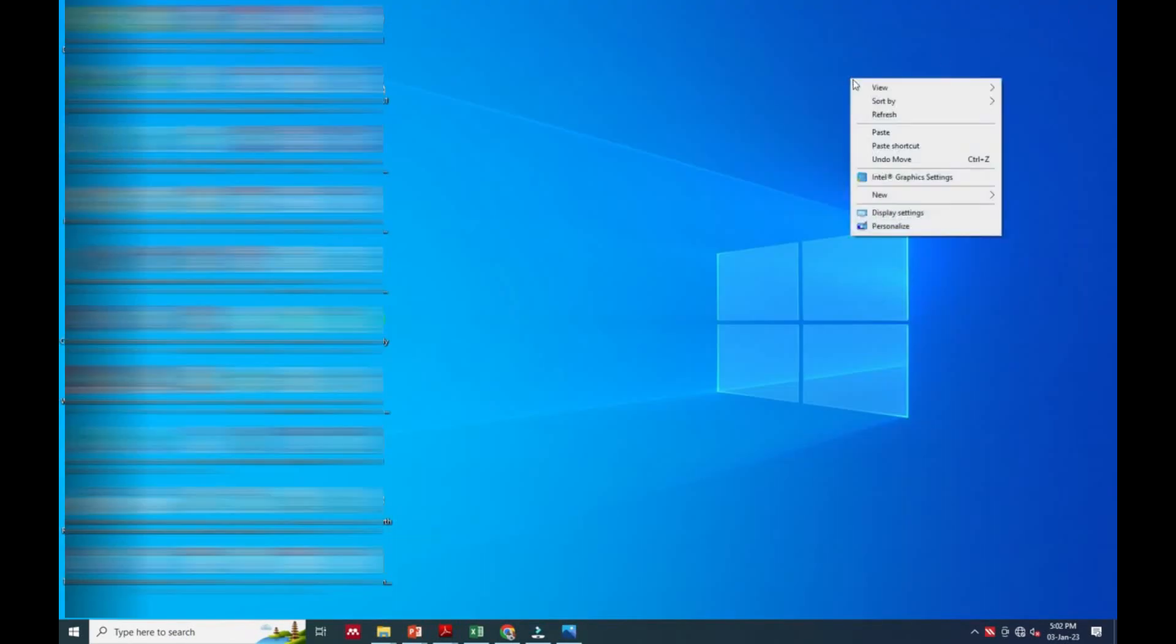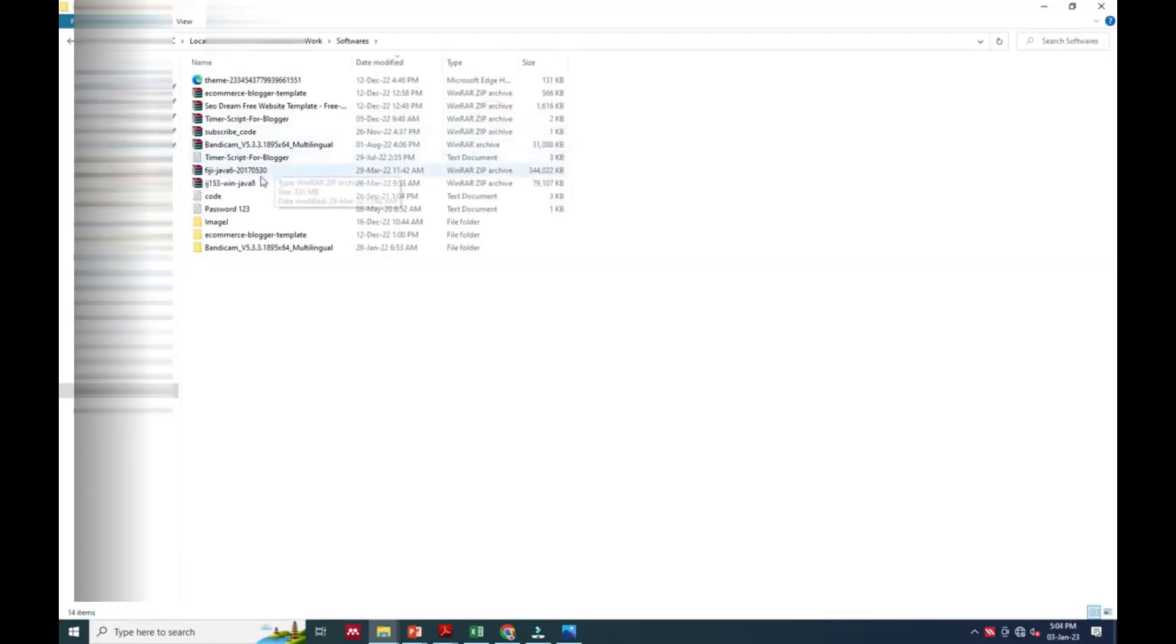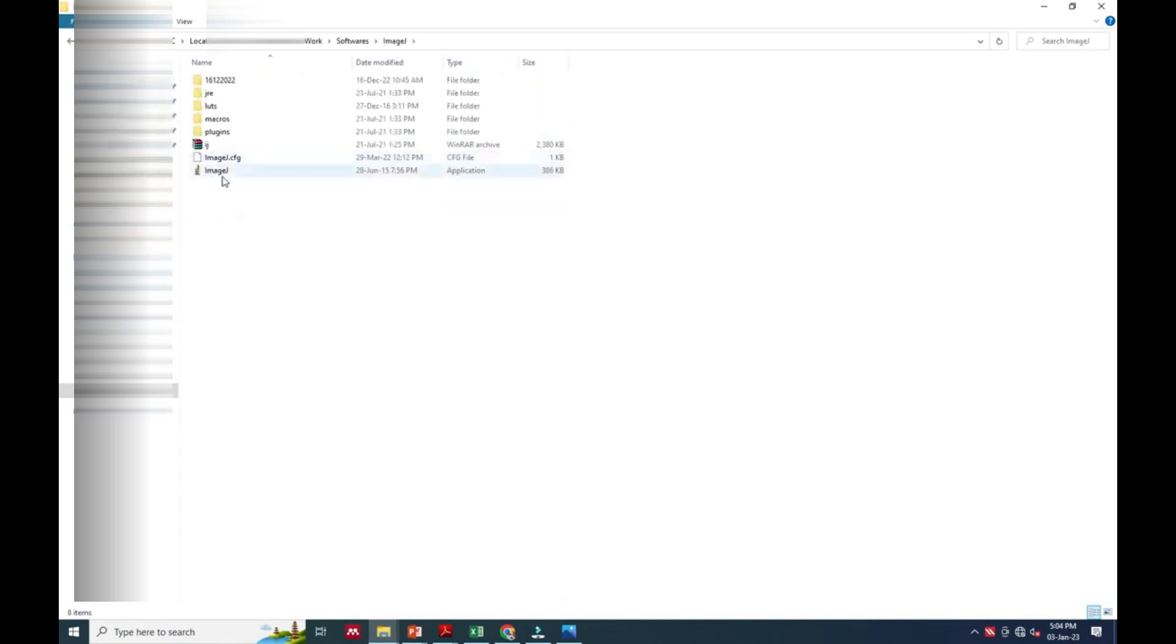I am going to put it on the desktop so that we can use it in ImageJ software. So here we have ImageJ software that I am going to install.